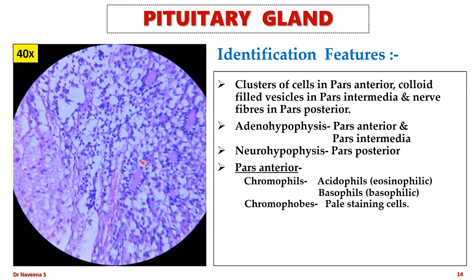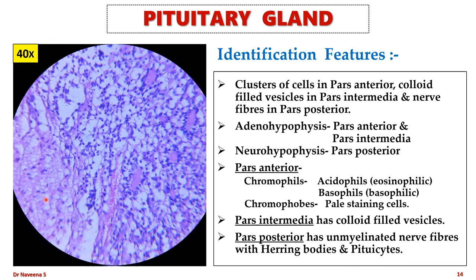Pars intermedia has colloid-filled vesicles and loosely packed pale-staining cells which may secrete melanocyte-stimulating hormone. Pars posterior has unmyelinated nerve fibers with Herring bodies at their nerve terminals, where they store vasopressin and oxytocin. These nerve fibers are supported by supporting cells called pituicytes.